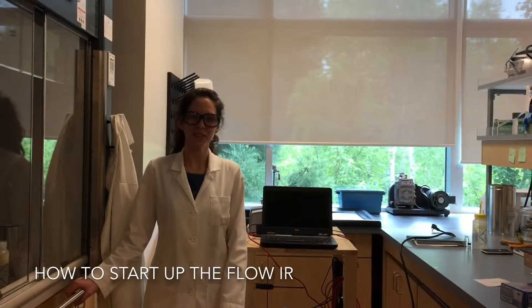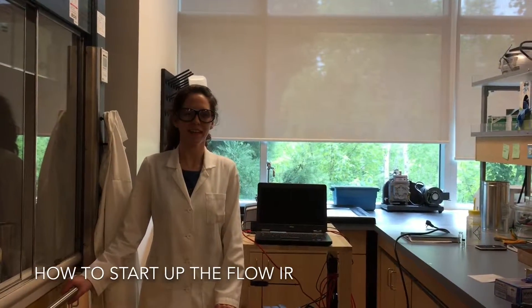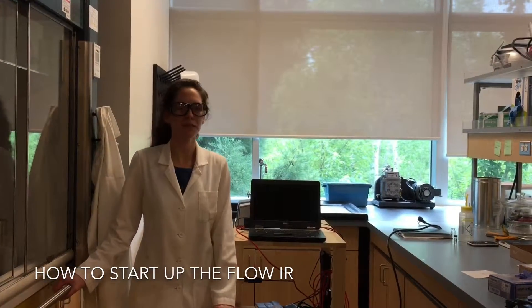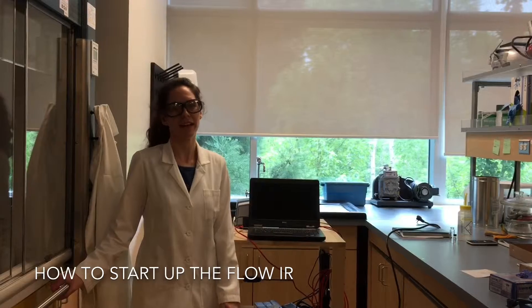Okay, I'm going to show you how to make an IR measurement on the Flow IR that we've set up.